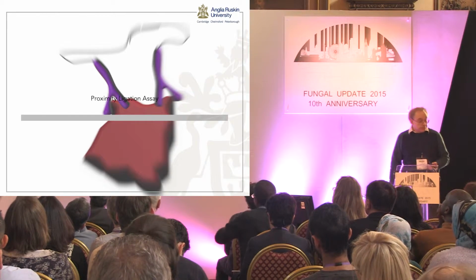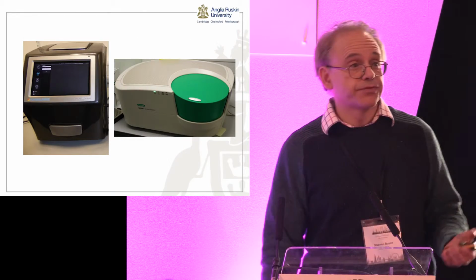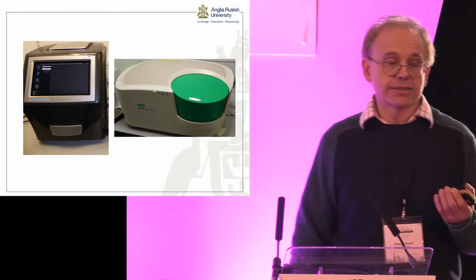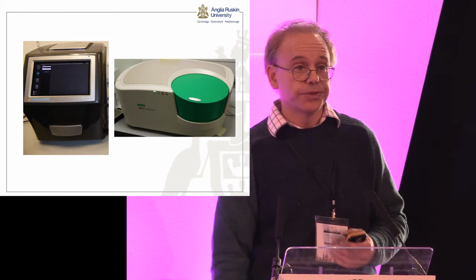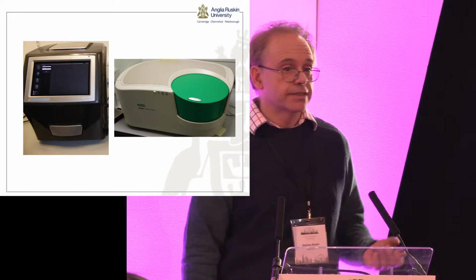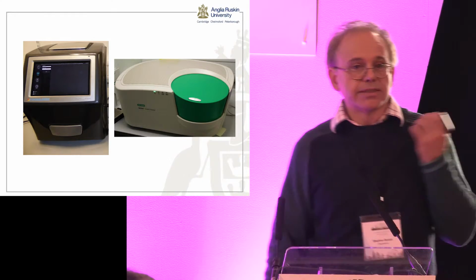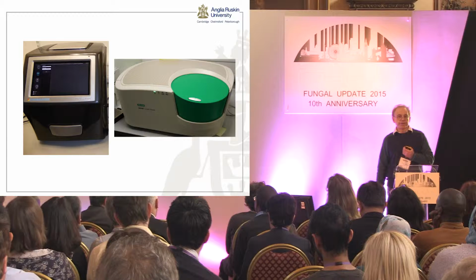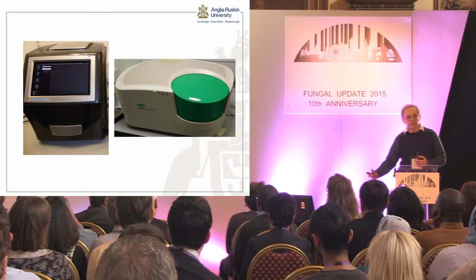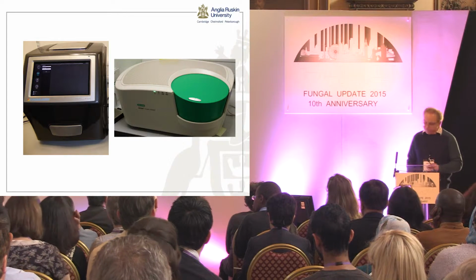The proximity ligation assay, which Gemma talked to you about briefly, we've used two different methods. The main instrument on the market is Bio-Rad's QX100 or 200. The problem with that instrument is twofold. Firstly, you have to use their reagents, which makes it expensive. And secondly, because you're using proteins and the Bio-Rad instrument depends on droplet generation, it interferes with the droplets and you don't get a lot of droplets. So instead of getting 18,000 droplets, you end up getting 12,000 droplets, and so you have a problem with the quality of your results.